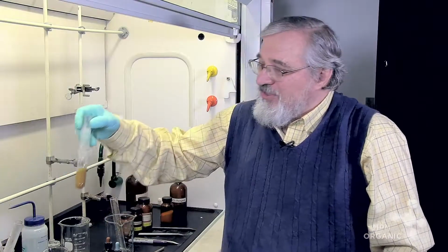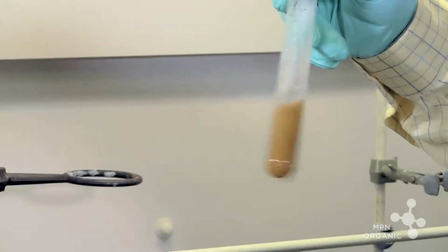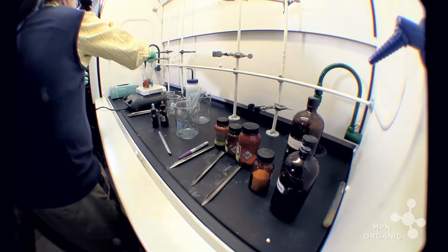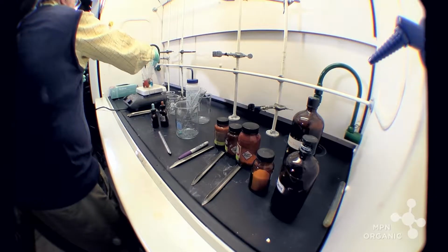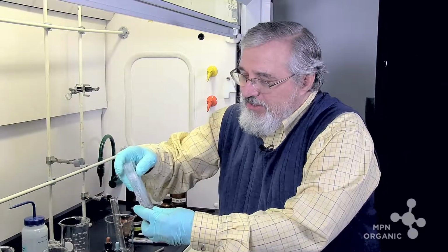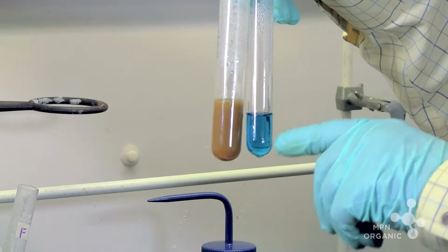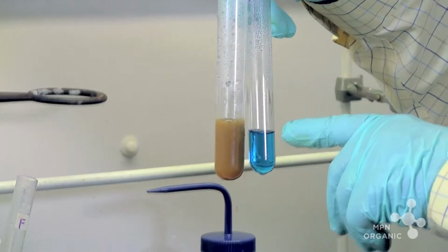You can see after some heating that the color is starting to resemble the colors that we saw with lactose and glucose and fructose here. And this is the sucrose solution with Benedict's without that pre-treatment with sulfuric acid.